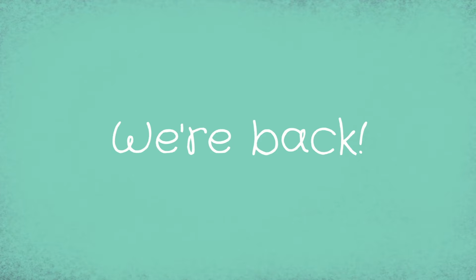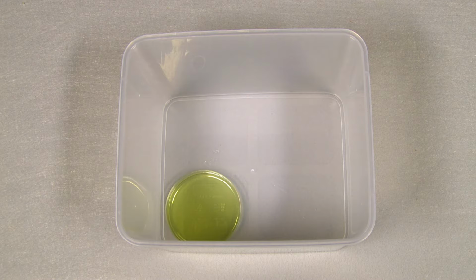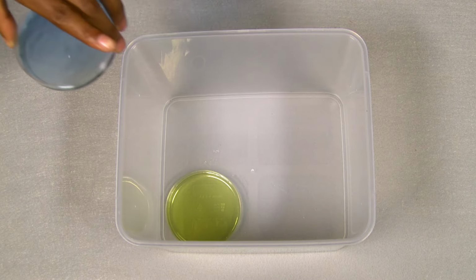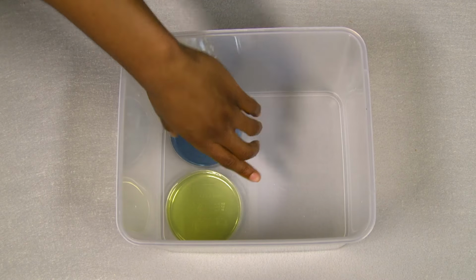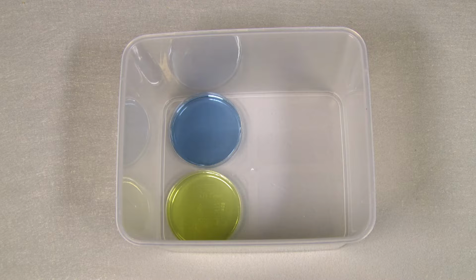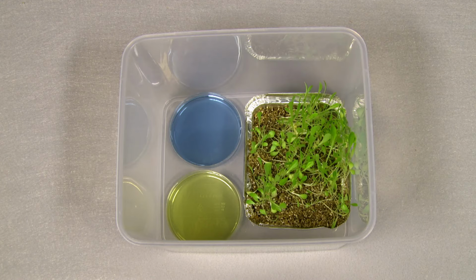Okay, we're back. You've made your predictions. Now let's start with the light investigation. We put the BTB in with the plants. And remember, if BTB is yellow, we've got a high concentration of carbon dioxide. If it turns blue, there's a lower concentration. Let's see what our little plants did overnight while we took a break.